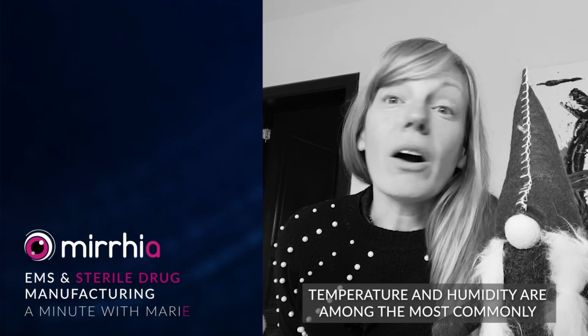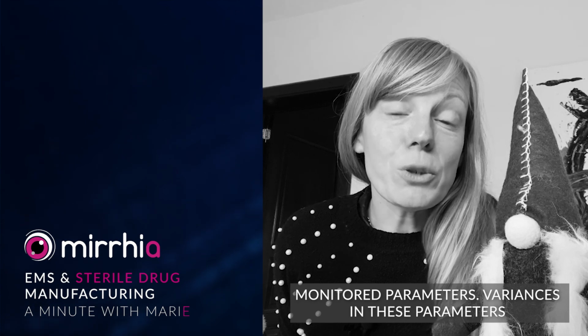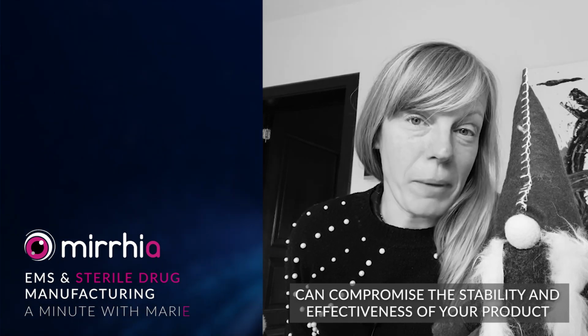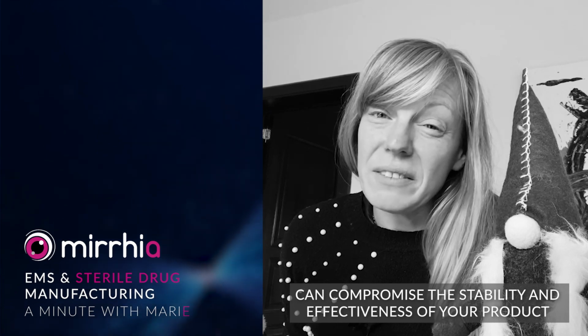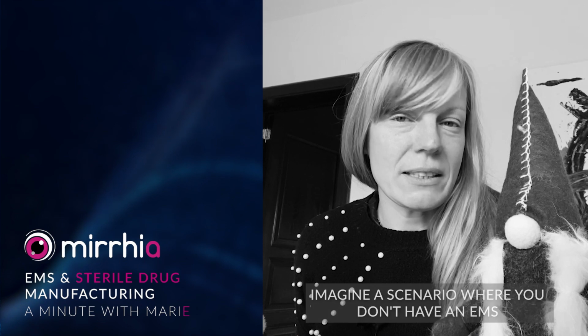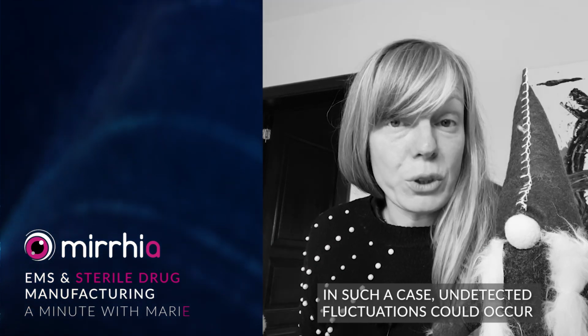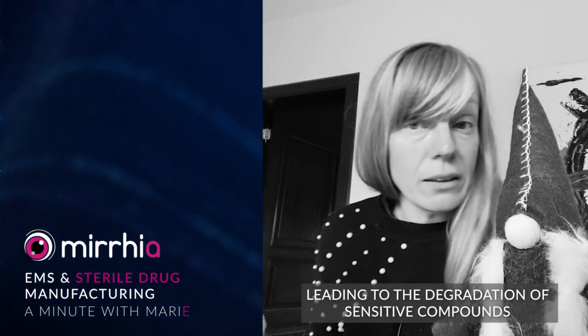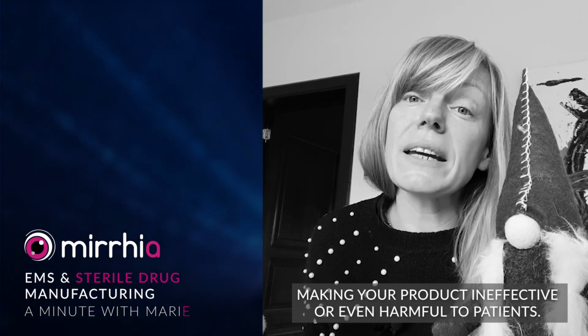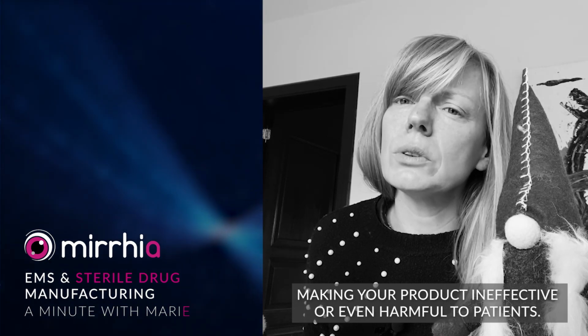Temperature and humidity are among the most commonly monitored parameters. Variances in these parameters can compromise the stability and effectiveness of your product. Imagine a scenario where you don't have an EMS. In such a case, undetected fluctuation could occur, leading to degradation of sensitive compounds, making your product ineffective or even harmful to patients.